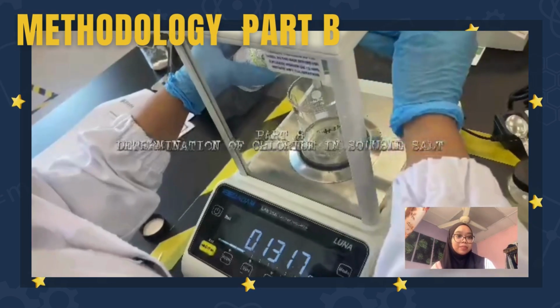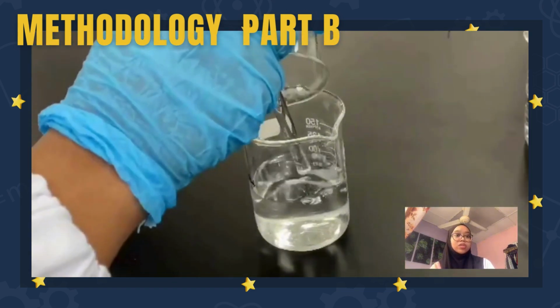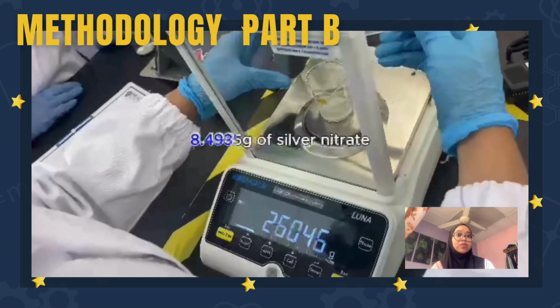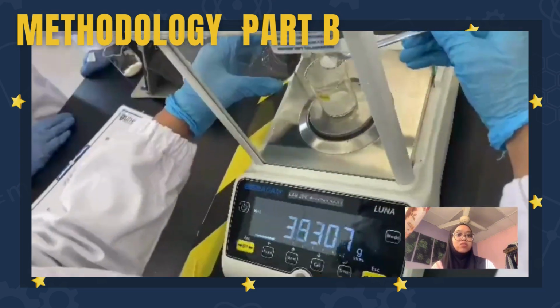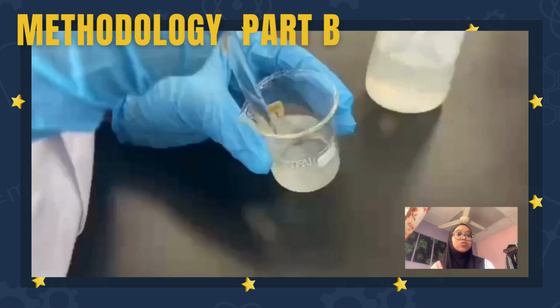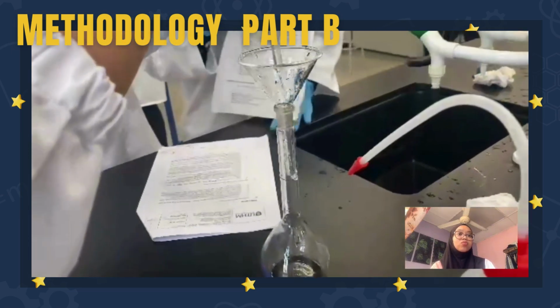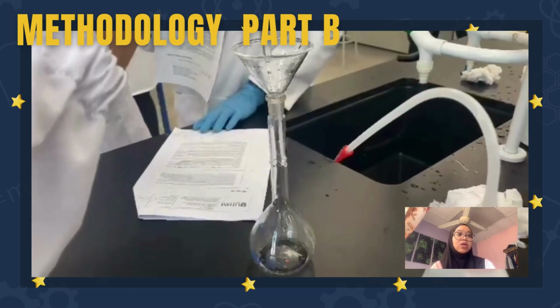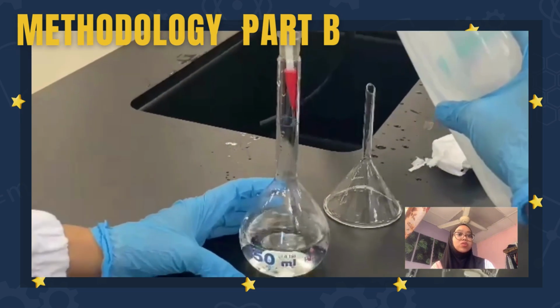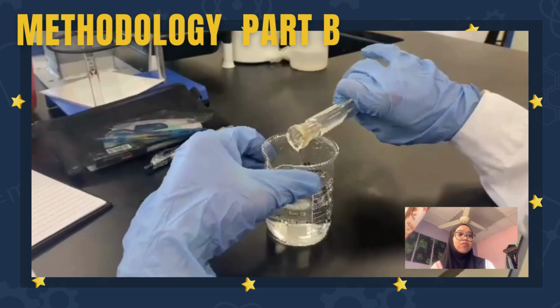Okay, now for the methodology, part B. 0.5 gram of NaCl was added to the beaker and distilled water was added to dissolve the NaCl. 8.4935 gram of AgNO3 was weighed and distilled water was added. The solution of AgNO3 was transferred to the 250 ml volumetric flask for dilution. 125 ml of AgNO3 was used for each beaker.